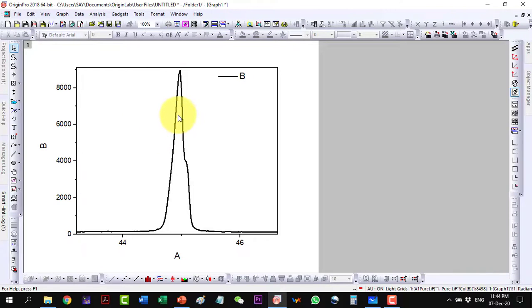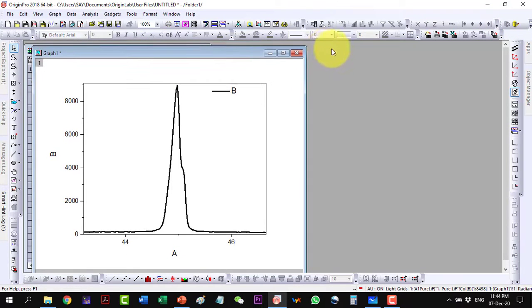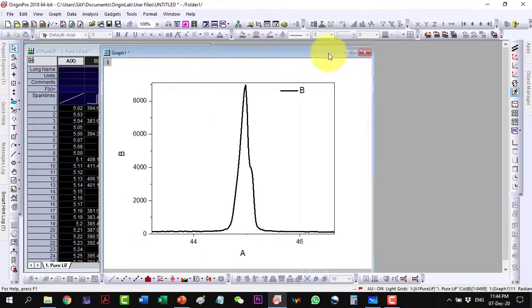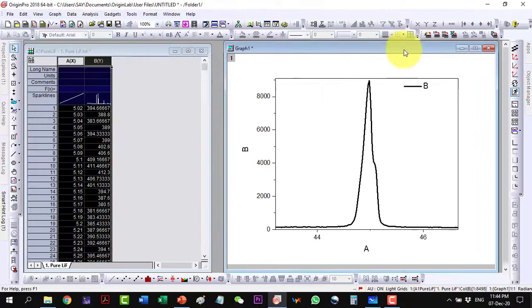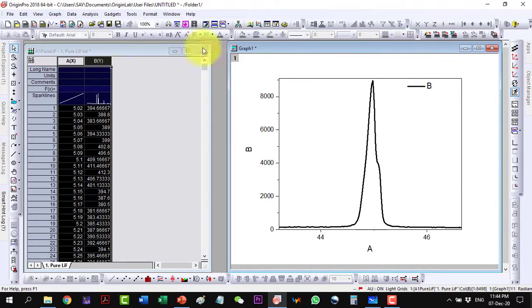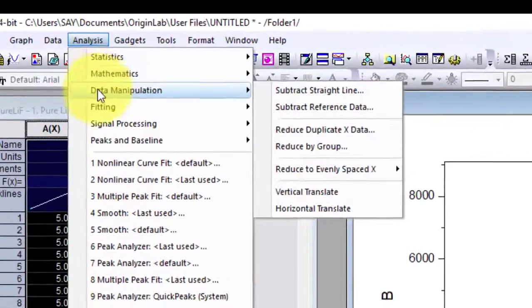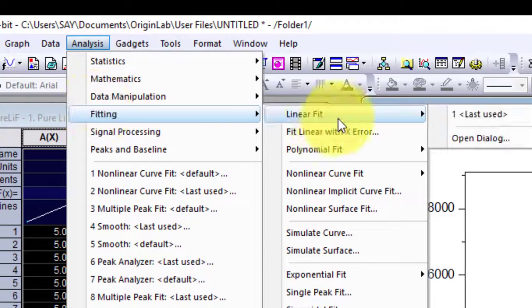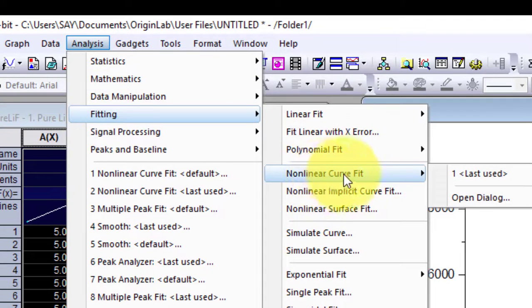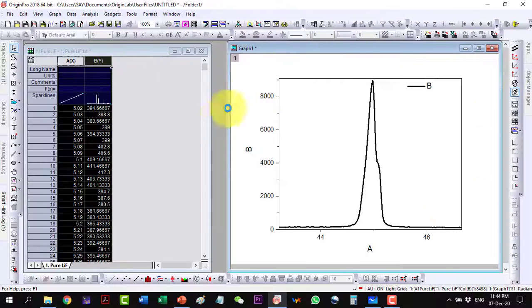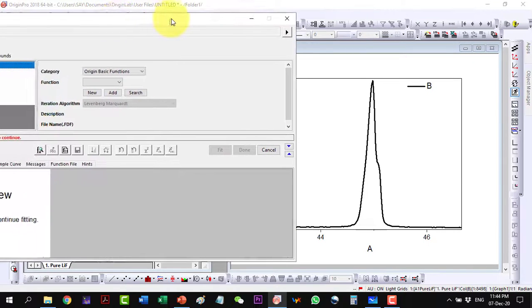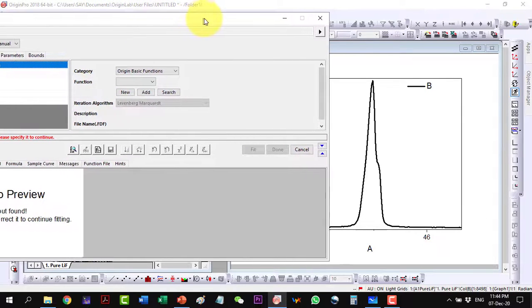Our plot is ready to be fitted and I do some arrangement here. Now I go to Analysis, Fitting, and the Non-linear Fit, and I open the dialog box and here it is.